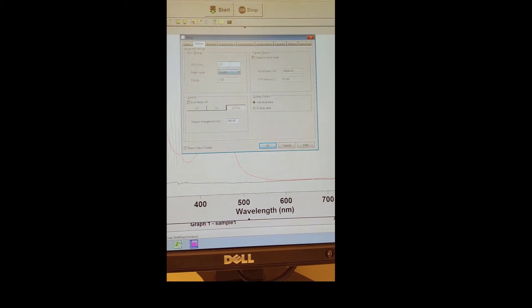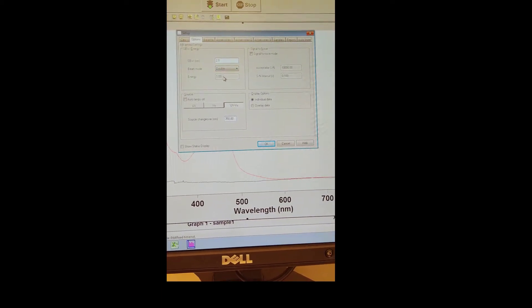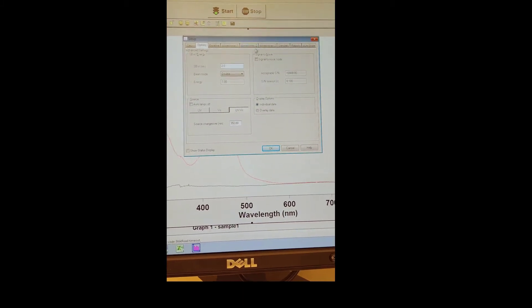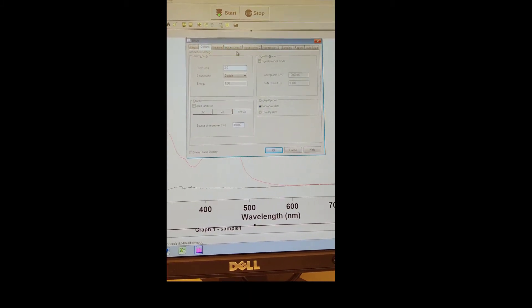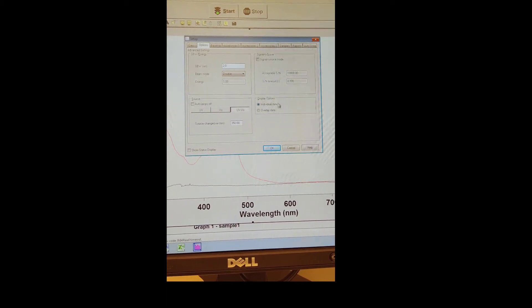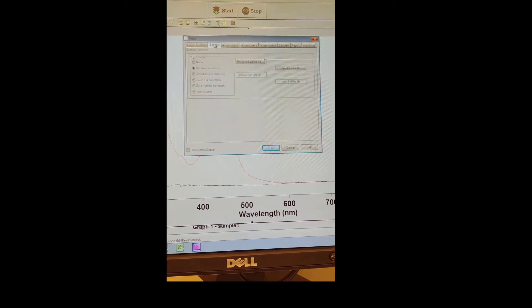Under the Options tab, make sure 2 is in that field right there, and make sure you're in double beam mode. Make sure Auto Lamps Off is not selected. Make sure Signal to Noise mode is not selected. Under Display Options, I like to select individual data because that makes the spectrums easier to look at.